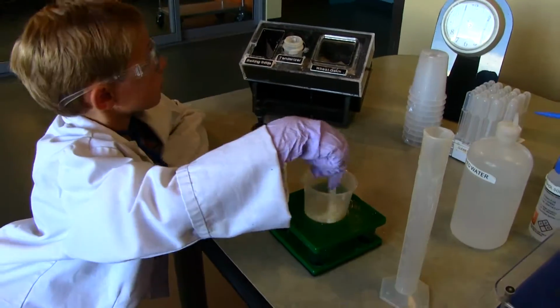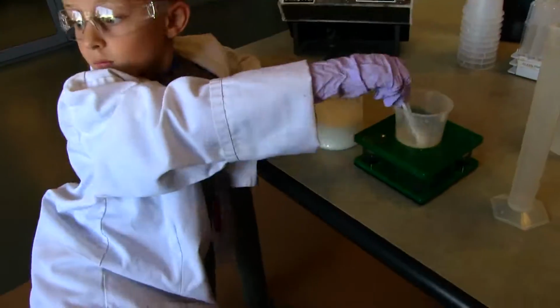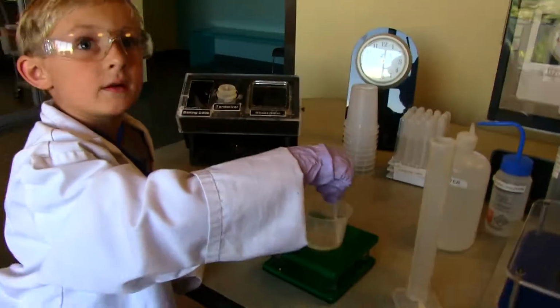I've been stirring another minute. Will we get to do all the experiments?